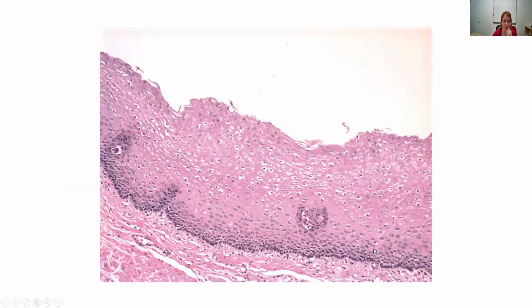All right, this one tripped up a lot of people on the practical. I look like I've got some layers going on here, so let me see if I can figure out what's going on. If I have an arrow pointing to this area right here, first thing I see, there is an edge. This is an epithelial tissue. So if I'm looking at epithelium, I can just mentally throw out muscle, nerves, all the connective tissues, they're gone.